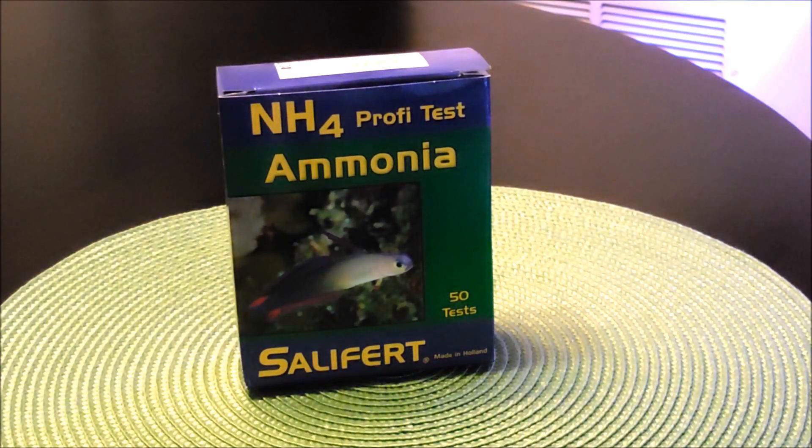Hi fellow reefers, this is Eddie of Eddie's Reef Aquaria. On today's video I'm going to do the last test kit by Salifert that I had promised I would do along the way. The one remaining of course was the Ammonia. So I'm going to go ahead and demonstrate to all of you what it contains and how to actually do the Ammonia test by Salifert. And here we go.